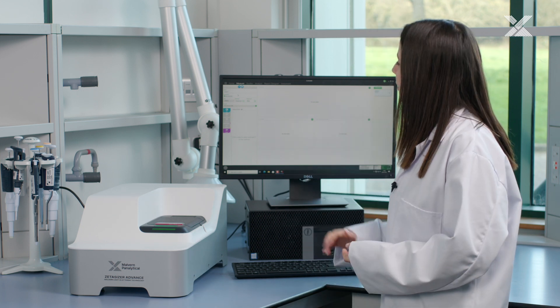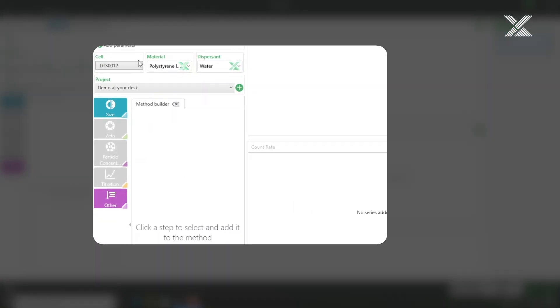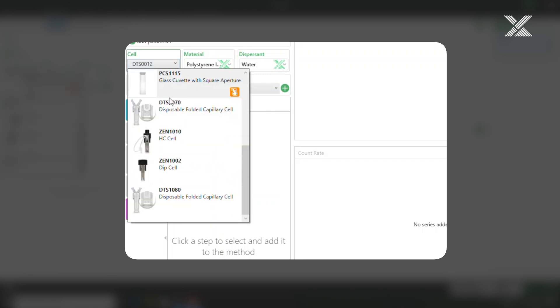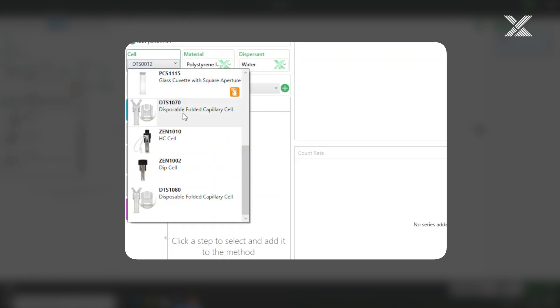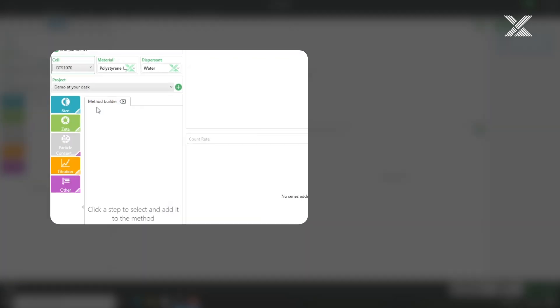And now we can move on to the software to create our method. First of all we need to name our sample and then we need to select the correct cell for the zeta potential measurement. So if we scroll down we can select the DTS 1070 cell.